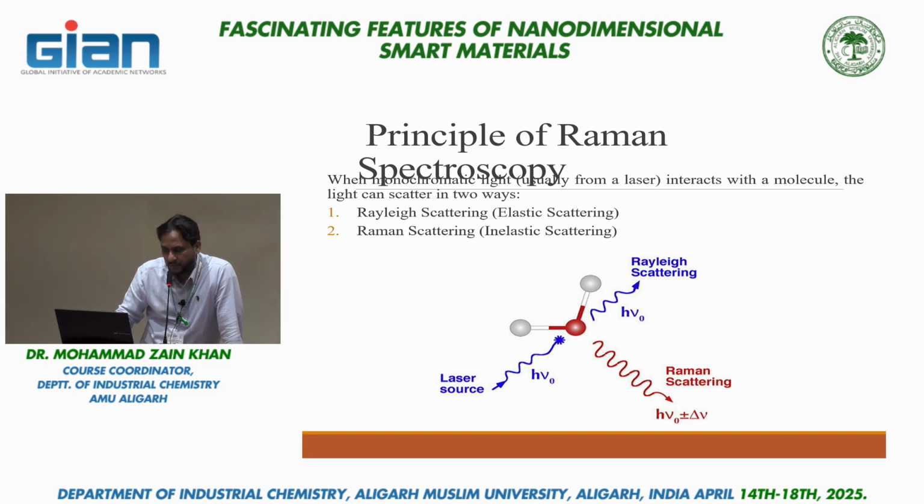The principle of Raman spectroscopy. When light falls on matter, when light interacts with a sample, this interaction may be either elastic or inelastic.